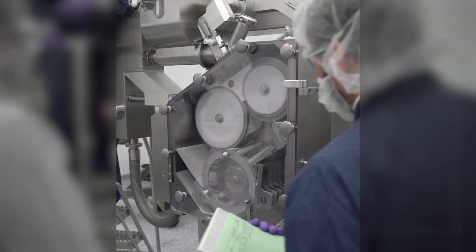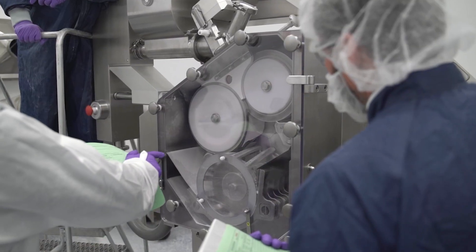Roller compaction is the continuous processing of dry fine powders or powder blends into flat shaped compacts that are milled into the desired granule size. The milled ribbons are used to prepare blends that can be compressed into tablets, filled in capsules, or powder into sachets.